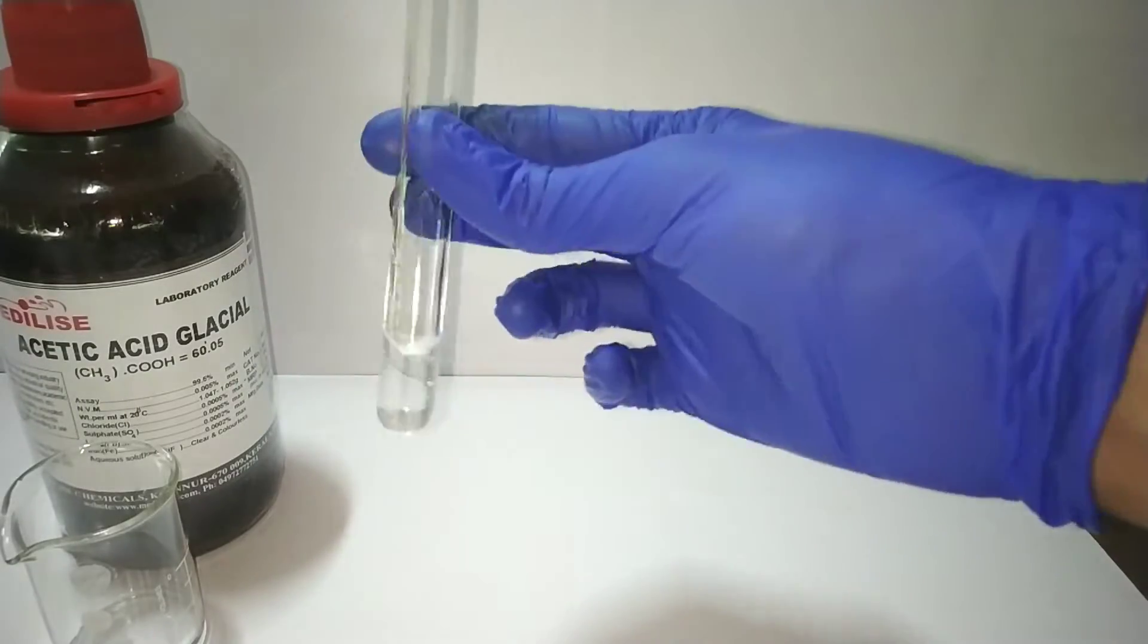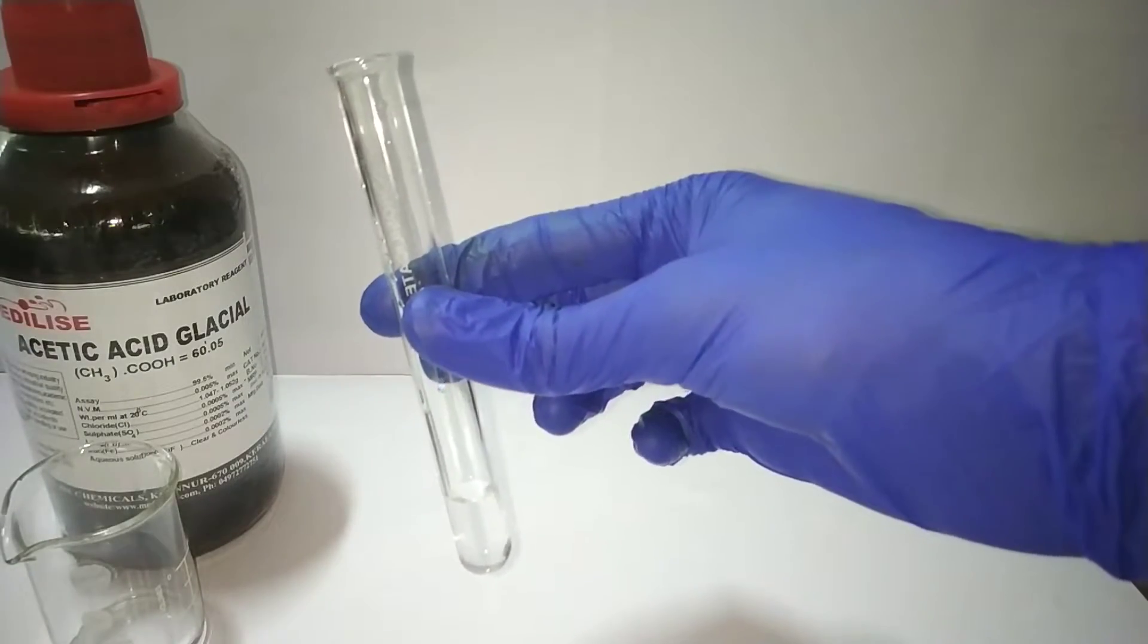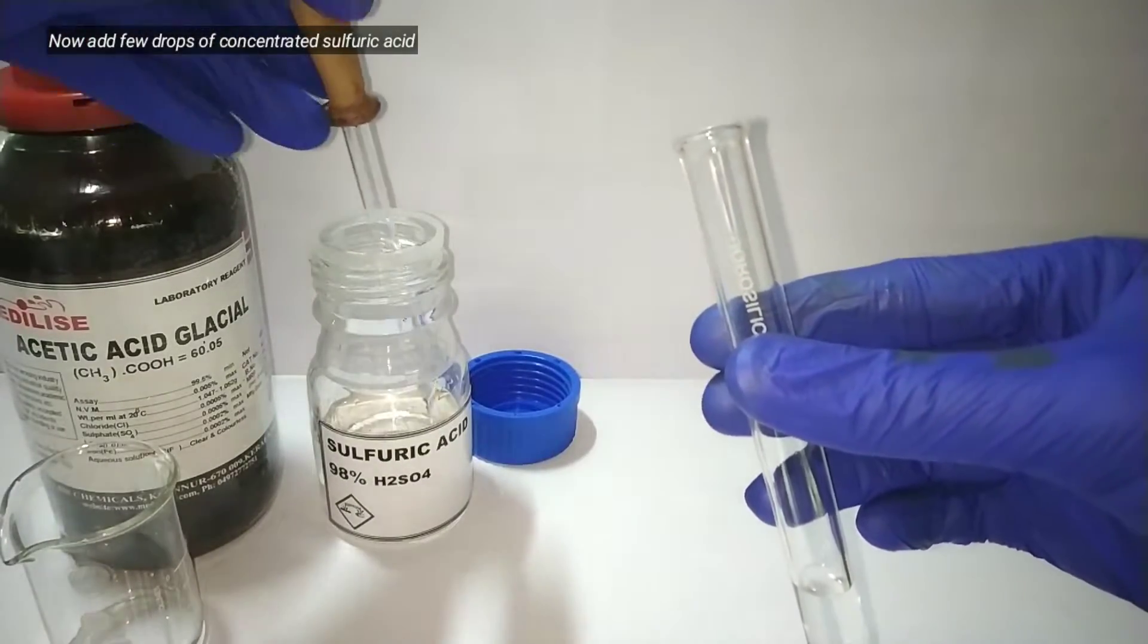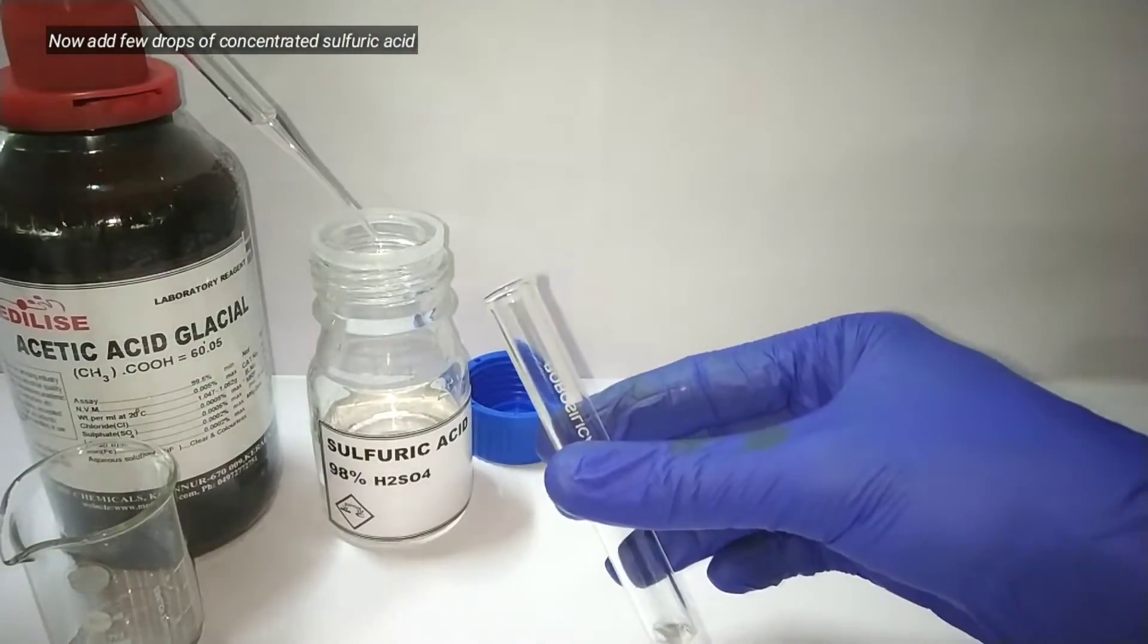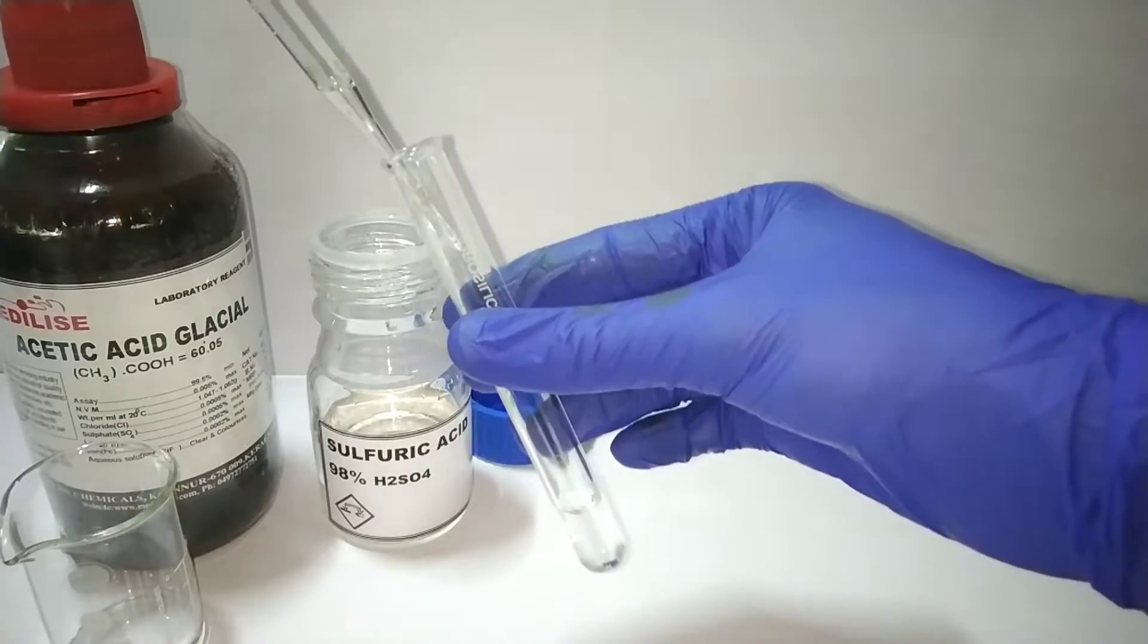Then we mix the compounds by shaking. Now add three to four drops of concentrated sulfuric acid into the test tube and mix the test tube well.